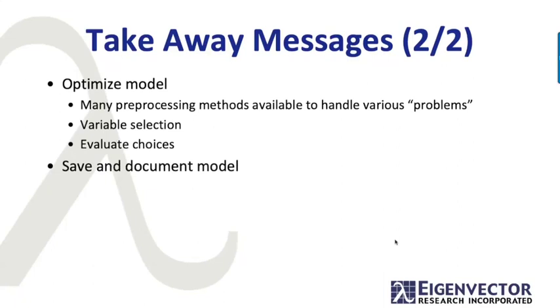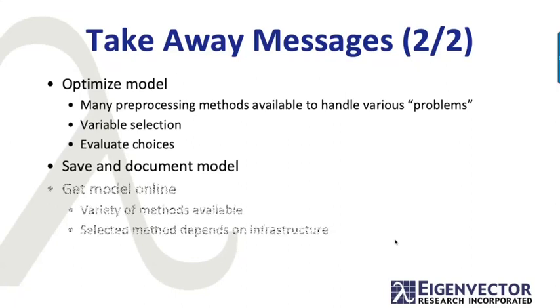Save and document the model. You'll almost always need to have some documentation as to what was done. That could be a lot of help when you have to redo the model later and update it.